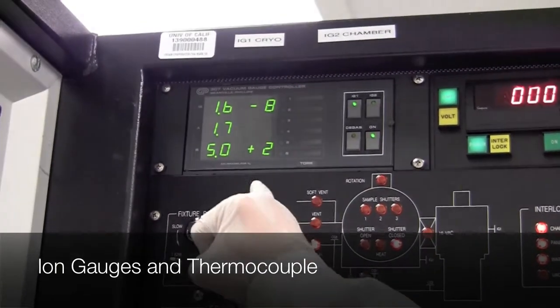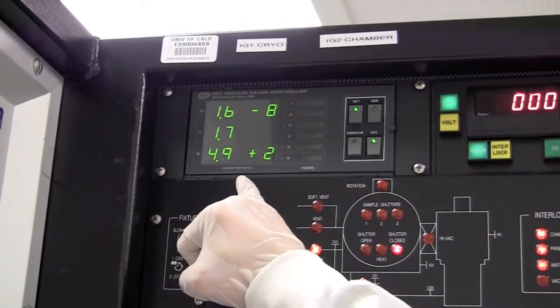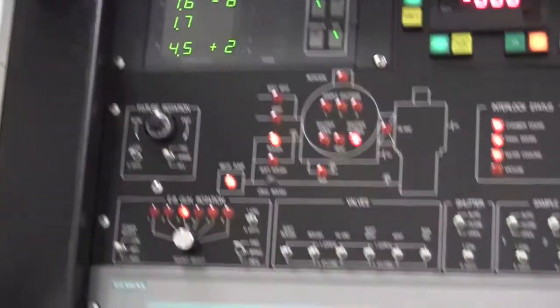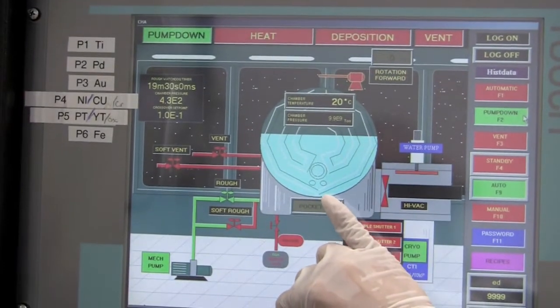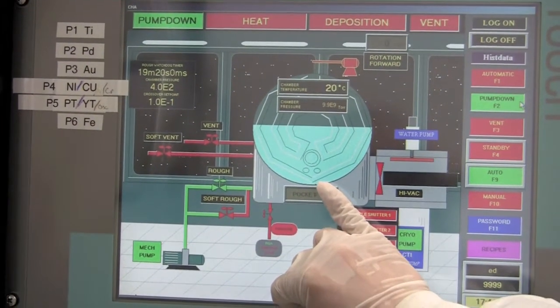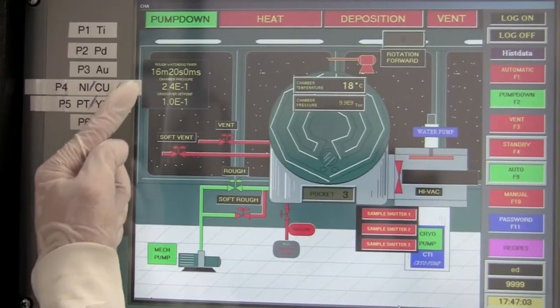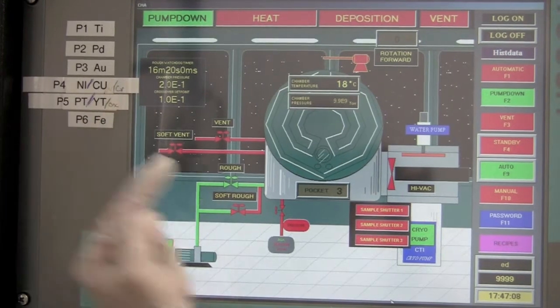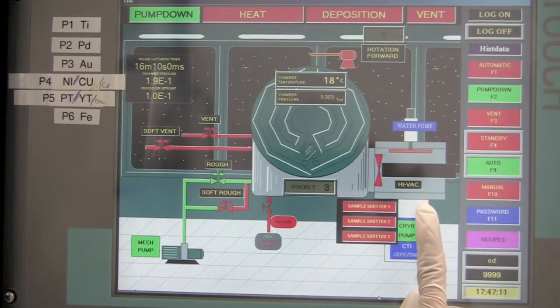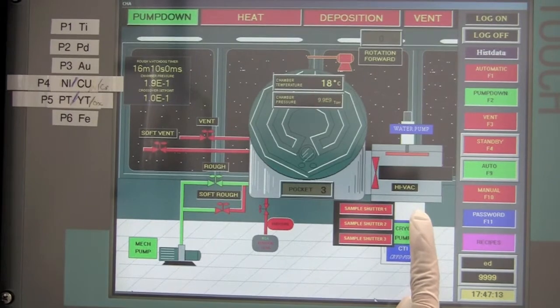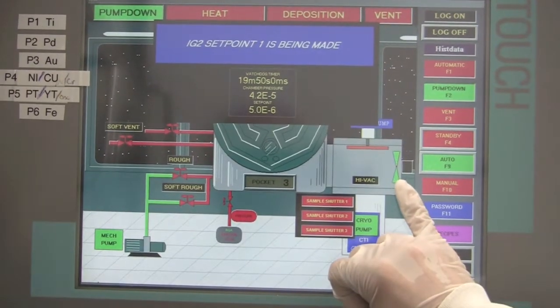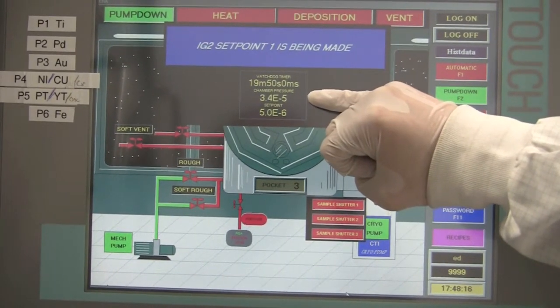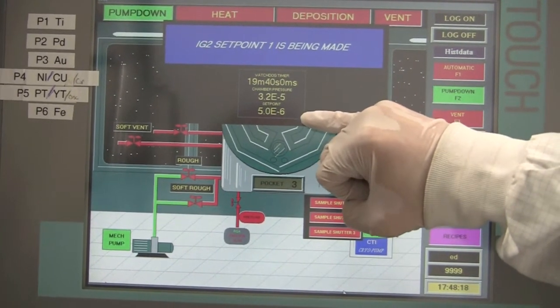Ion gauge one is for the cryo and ion gauge two is for the chamber. During roughing we can see the pressure drop from the reading from the thermal couple. We can also verify the pressure drop in the chamber by looking at the cartoon in the graphical user interface. After the chamber pressure reaches the set point of 1 times 10 to the minus 1 torr, the high vac valve should open allowing the chamber to pump down much faster. Now we can see that the high vac is open and the pressure has dropped to 10 to the minus 5. And now it's going to pump to the next set point 5 times 10 to the minus 6.